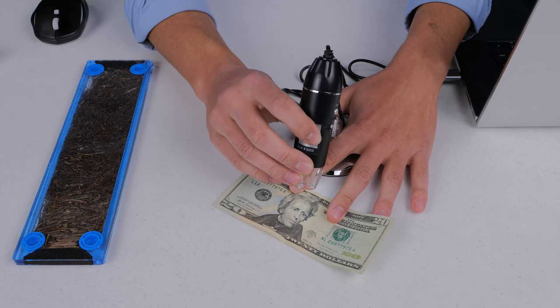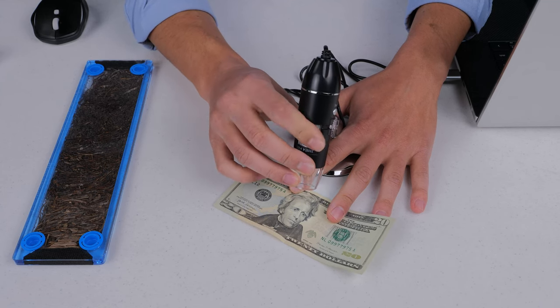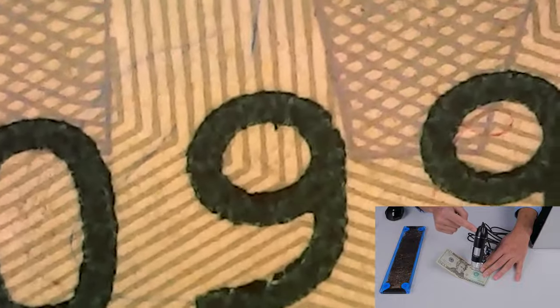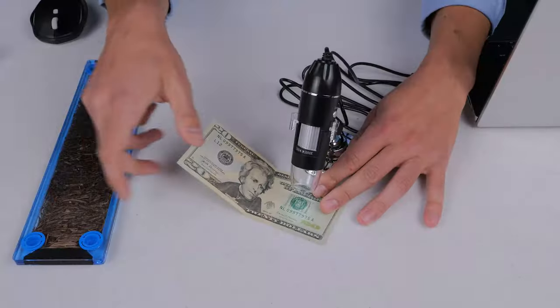These work pretty well as long as you're holding the object all the way up against the edge. If you have your object on the stand, it's actually fairly easy to keep things in focus, though if you shake the table the whole thing will move. This particular model actually does work pretty well, which surprised me — past USB microscope stands have never worked for me. There's also some interesting waviness in the image that I can't quite explain.